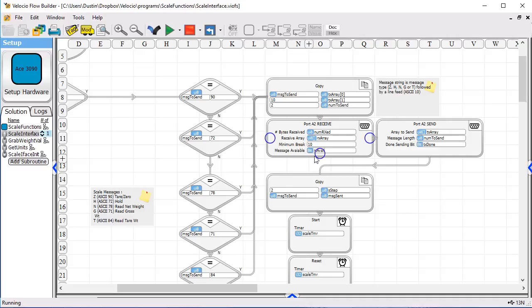And then we identify a flag called receive available. When that is set to a one, we have got an indication that we've got a message back there.